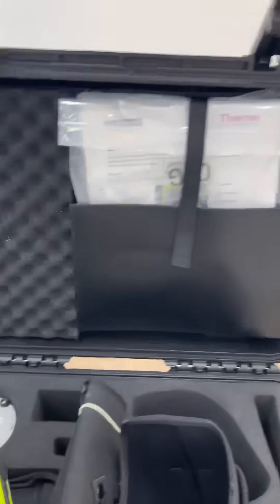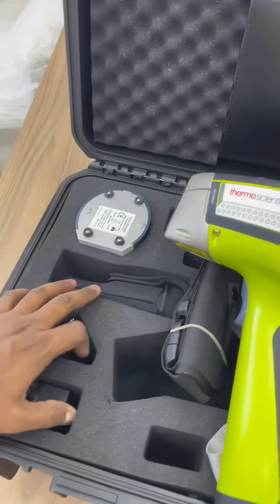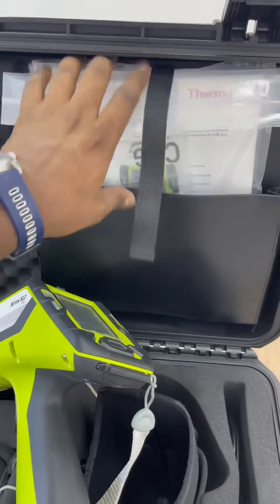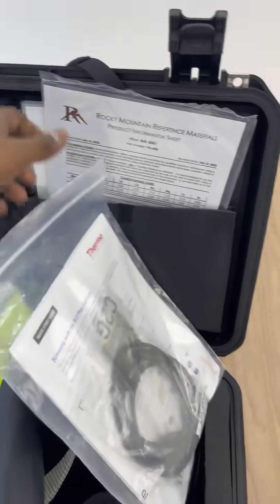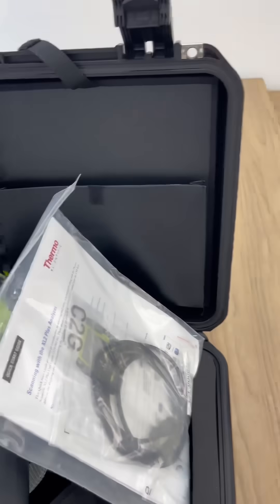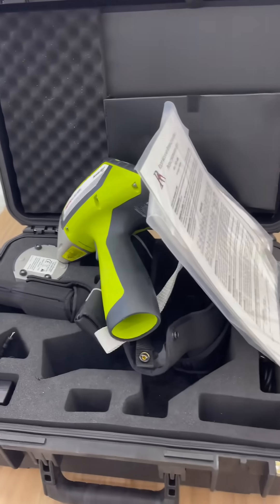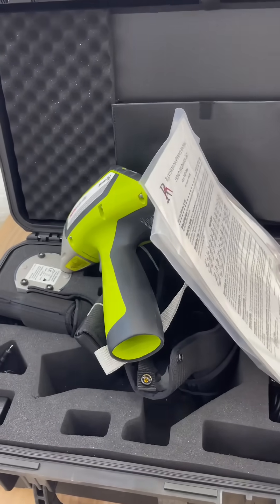It comes with a similar package to the normal XL2, which includes a battery station, a charger, a battery set, its adapter, and you will be having the samples over here for data transfer. And for the calibration units.